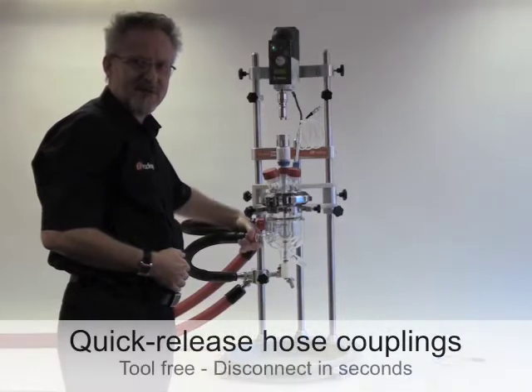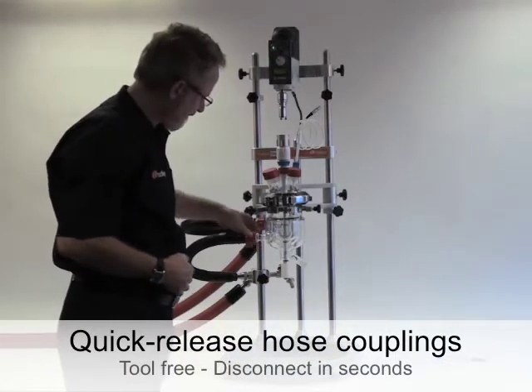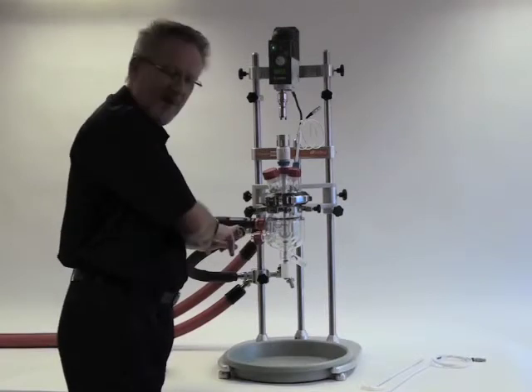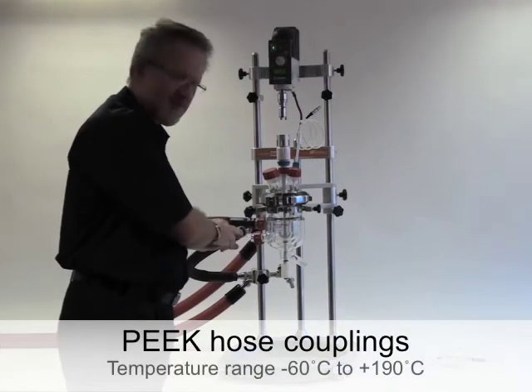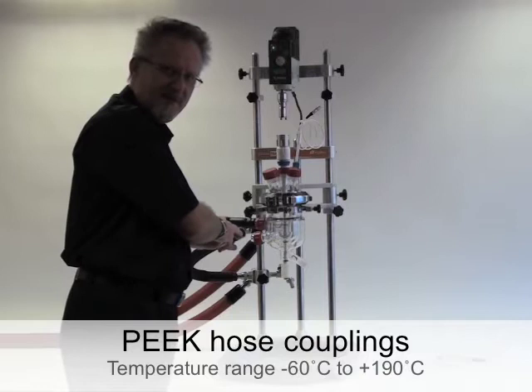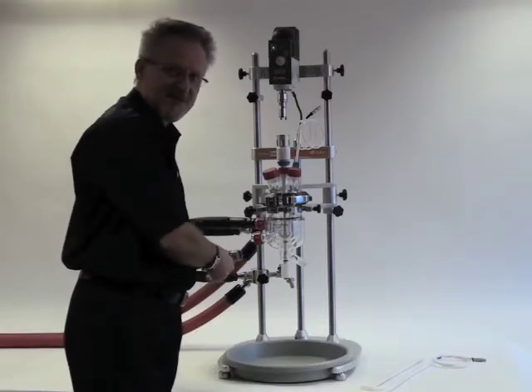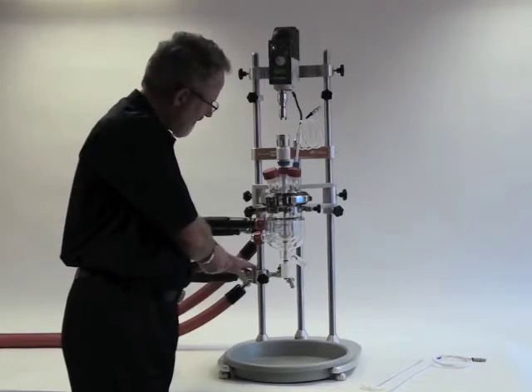Now I can remove the quick release jacket side arm connections. This part is made from PEEK and the seals are two VITON O-rings, one on the face of the flange and one on the side. The hoses themselves are supported from the frame, like these two manifolds.